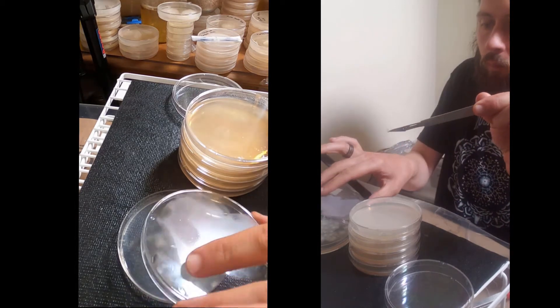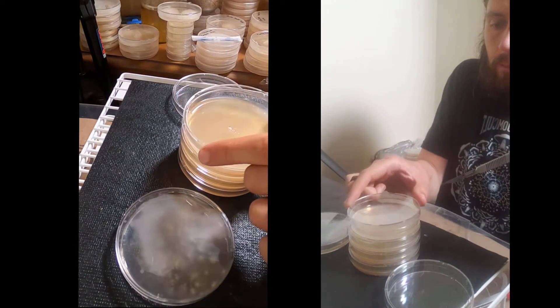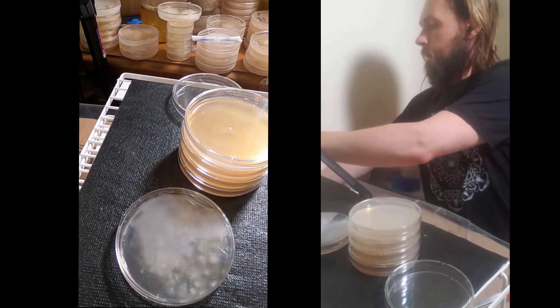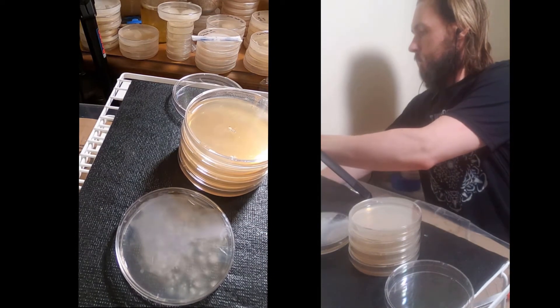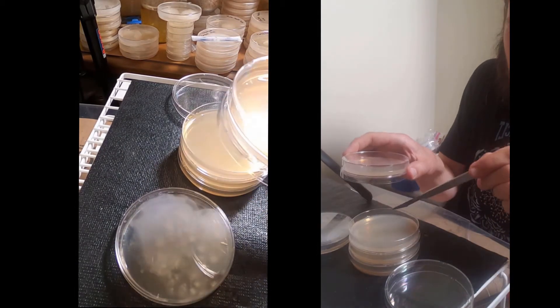This is a multi-spore inoculation on an agar plate where I took some spores off of a spore print and smeared them across the surface of the agar plate with an inoculation loop, and eight days later the colonies have developed.